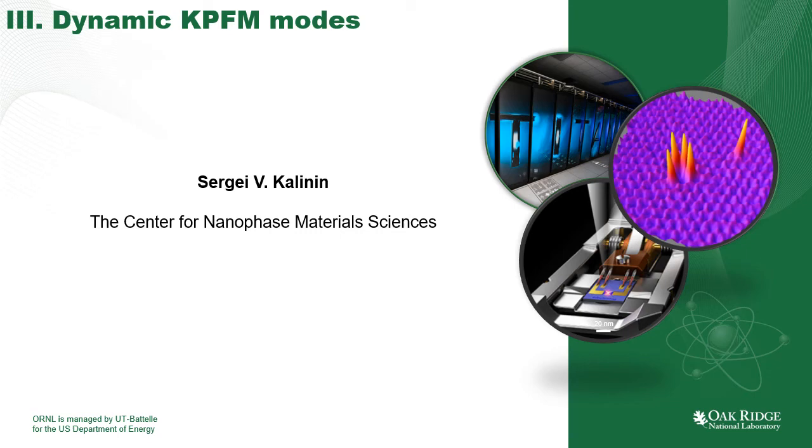Hello and welcome to the third lecture on the electrical and electrochemical characterization by scanning probe microscopy techniques. So here we are going to talk about the dynamic Kelvin probe force microscopy methods, which will include first the ways to run the KPFM, so what kind of engines can be behind the KPFM measurements, and also the spectroscopies based on the top of the KPFM detection.